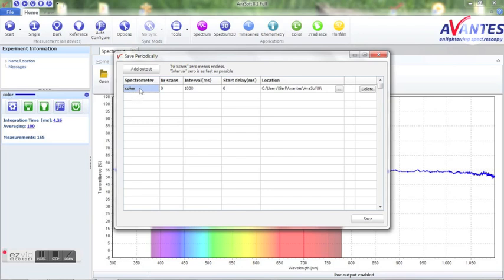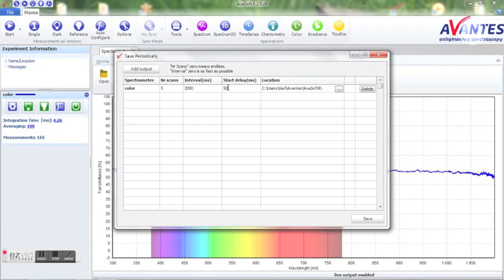Please select the numbers of scans, 0 means endless, interval in milliseconds, and if needed a delay. We'll take 5 scans, 2 seconds interval, and a delay of 5 seconds.